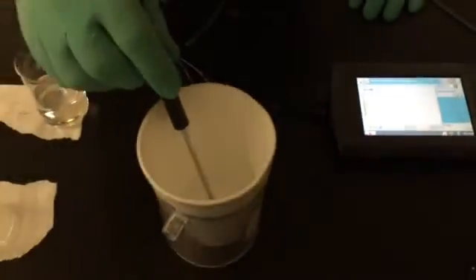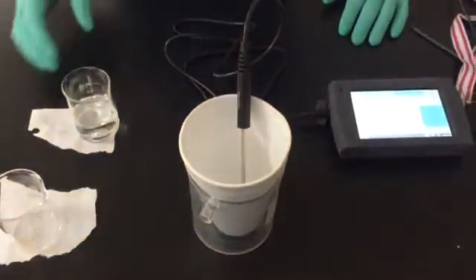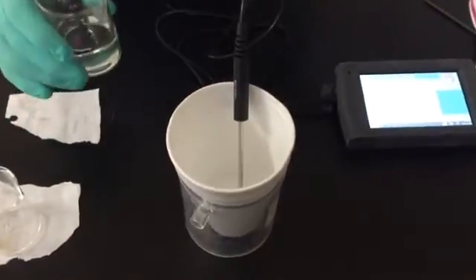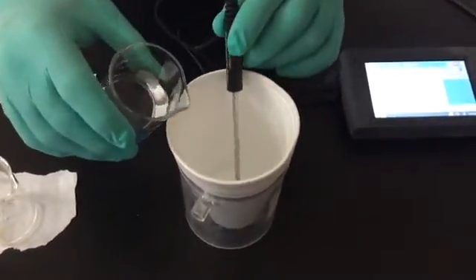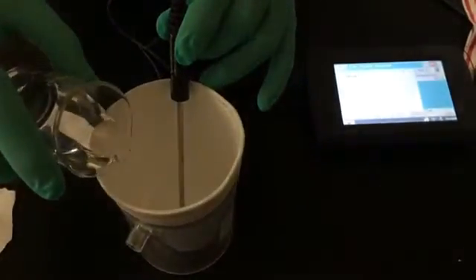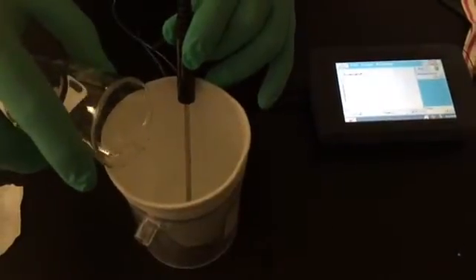I am adding our base, which is sodium hydroxide. There really is no indication that a chemical reaction is happening other than the temperature rising. Watch the temperature probe.